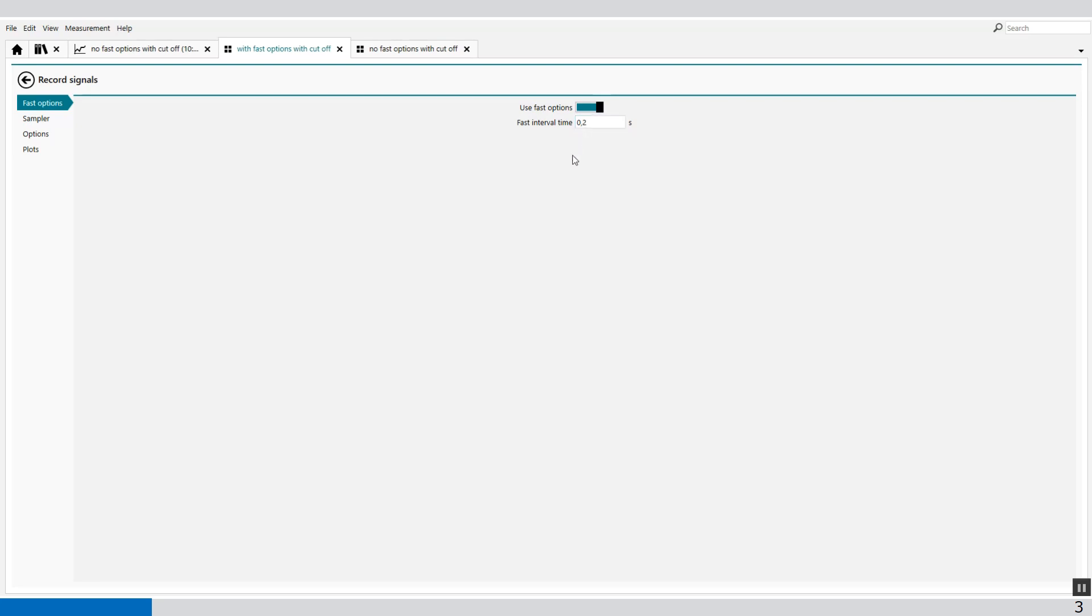Now we can sample with a faster interval rate. Instead of 2 seconds, we can sample at 0.2 seconds, which is 10 times faster than the normal interval time.